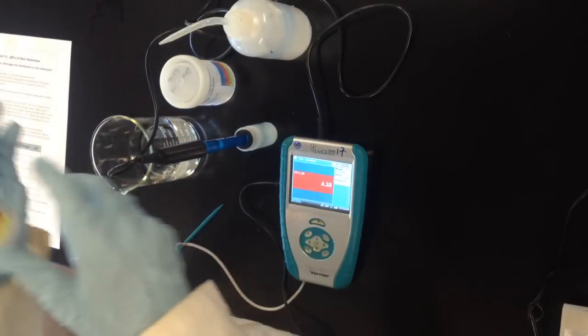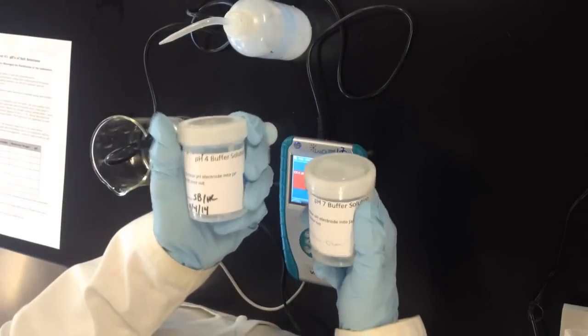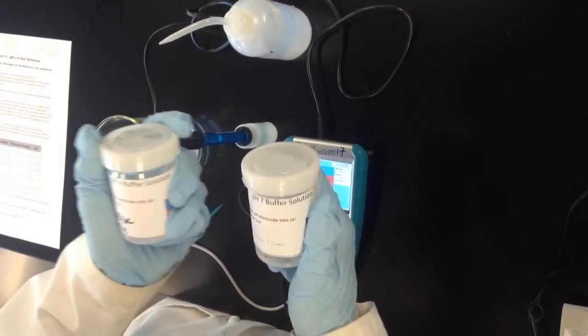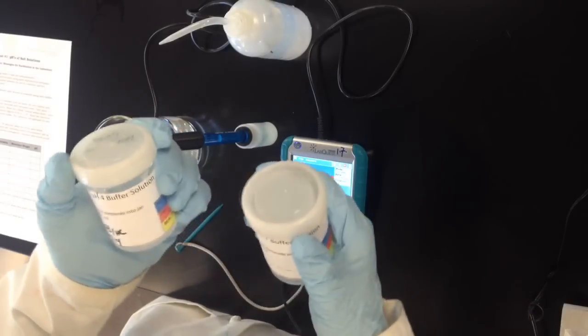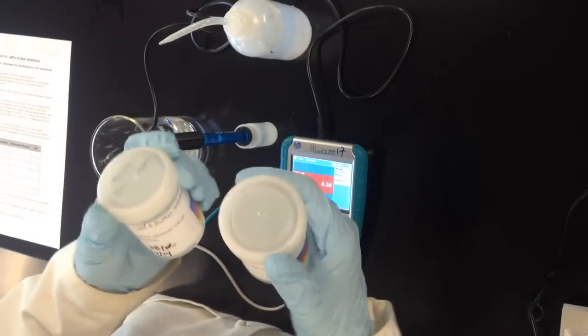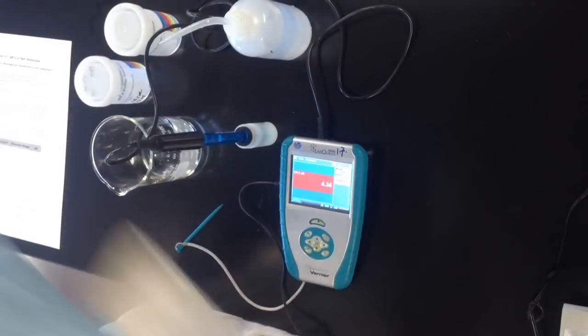To do this we're going to use two different buffer solutions with a set pH: a pH 7 buffer and a pH 4 buffer. When you calibrate, generally the true or known values you use should be in the range of the pH as you're going to get, and 4 to 7 is pretty close to most of the pHs we'll see in our experiments.